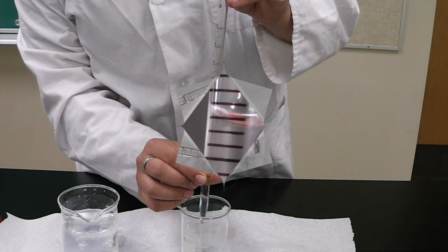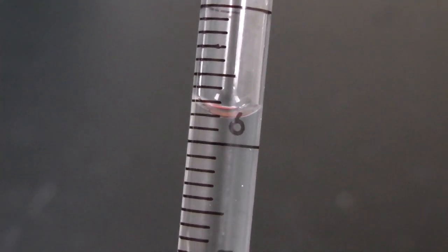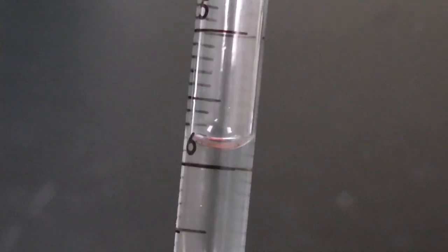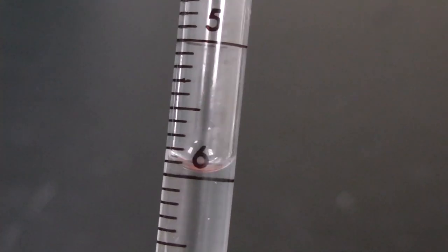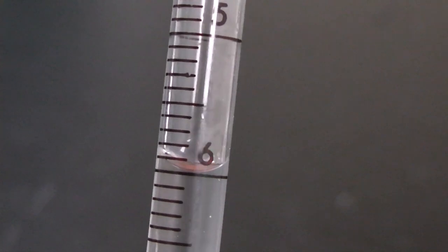In this example, I dispense five milliliters, so therefore I go from the one milliliter mark to the six milliliter mark, again rotating it carefully to only dispense the right amount of liquid.